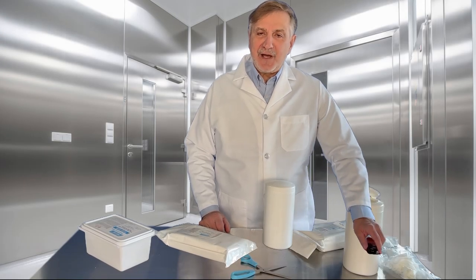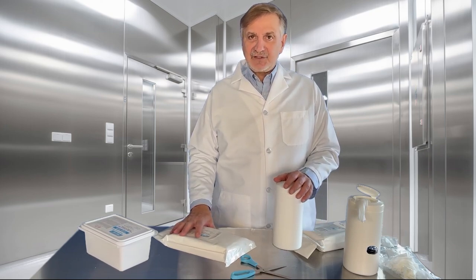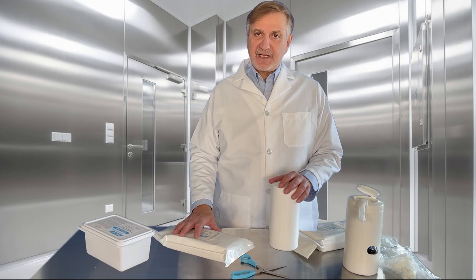Hi, I'm Claudio Arefeche from Hitech Conversions, and today I'm going to talk to you about three different packaging systems that are very common for pre-saturated wipes.